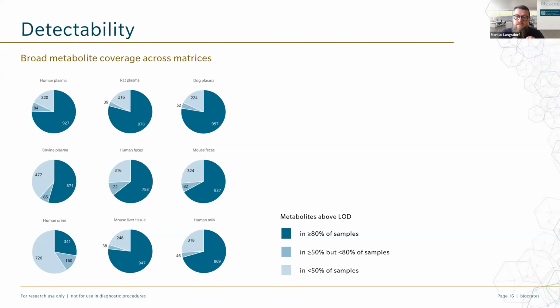Important to mention here, these numbers only serve as orientation. So we only tested a small number of samples to get an idea about the detectability. And the detectability strongly depends on the nature and the quality of the samples, and also on the instrument condition, of course.